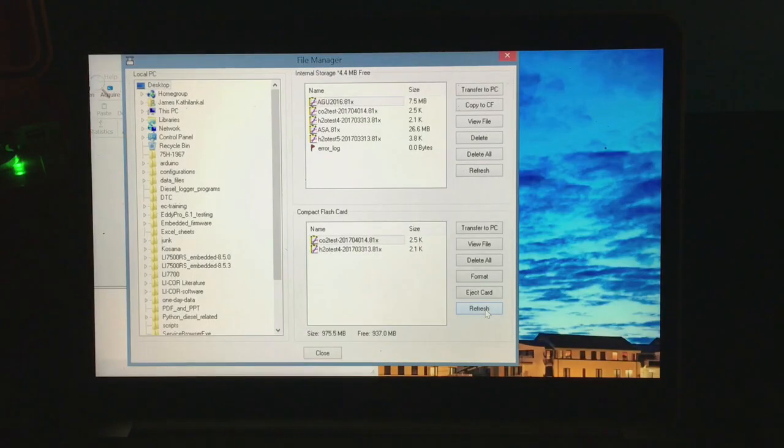An important thing to keep in mind is to make sure that the files you are recording data into are of smaller size so that they are easy to transfer. So it's better to split the files when you record the data into daily files. The internal memory, you don't want to put too much data in there, because if that fills up, it can affect the way the instrument performs. So make sure that periodically you clear the error logs and remove any files which you don't need from the internal memory of the 8100.